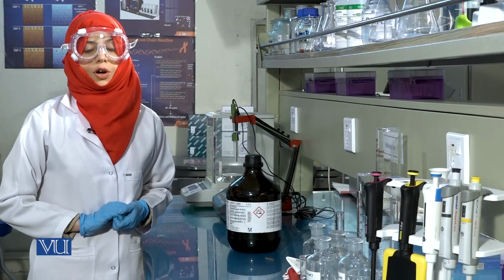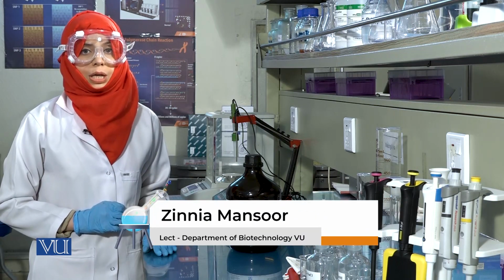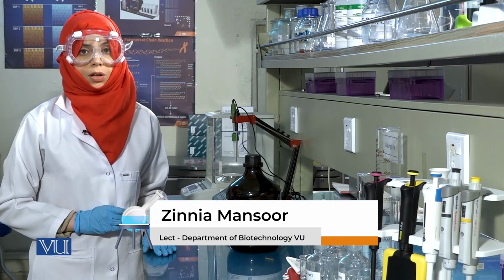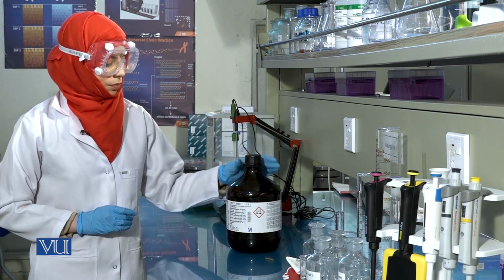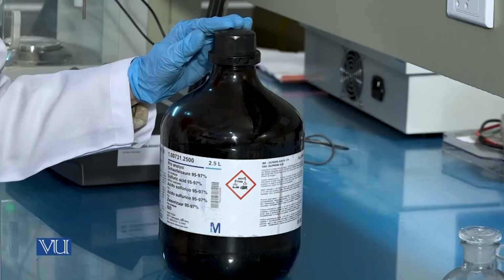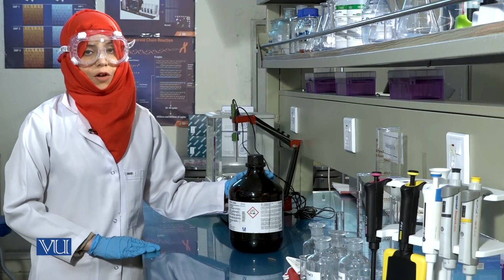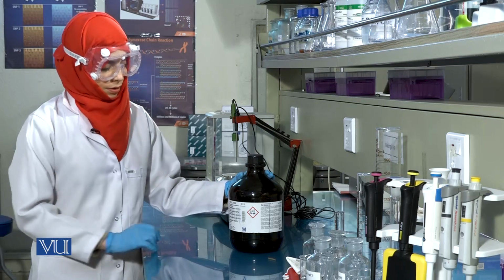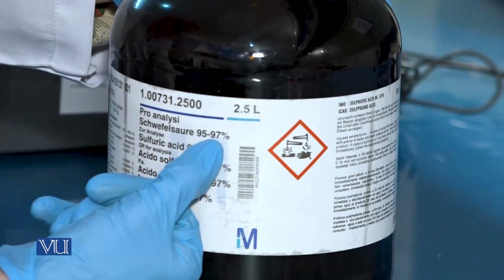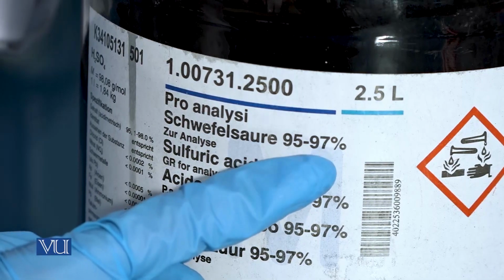We will now learn the concept of normality. Normality is generally used for acids and bases. To calculate the normality of an acid, we will need information from its bottle. This is a bottle of sulfuric acid. Check the percentage purity of this sulfuric acid. The percentage purity mentioned on the bottle is 97%.